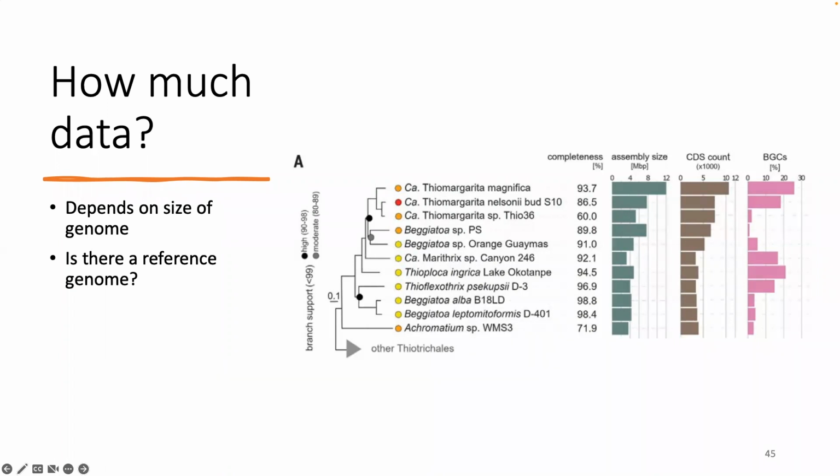In this paper, they did a little bit of a survey to see what the size of the genome is, and moving forward, when you go to sequence this, they would target some amount of coverage versus the known genome size to confidently call their SNPs and indels and so on. If you have a reference genome, typically a good target for bacterial samples is about 100x coverage. With a PCR-free library, you can be pretty confident that this is going to be even.